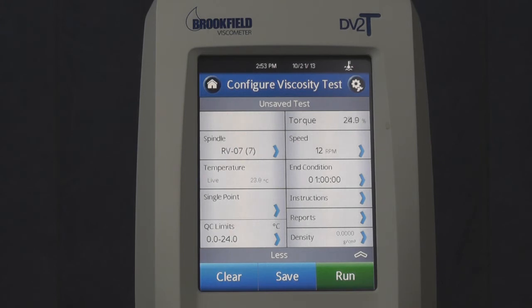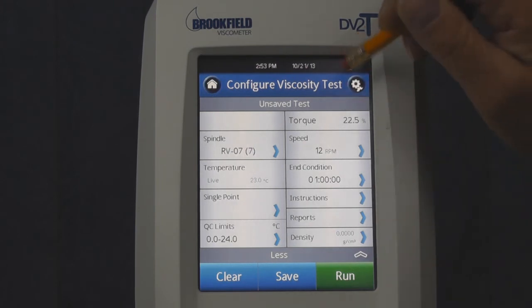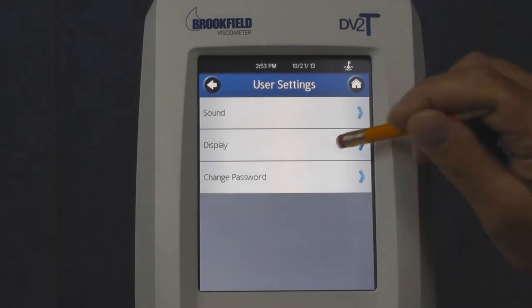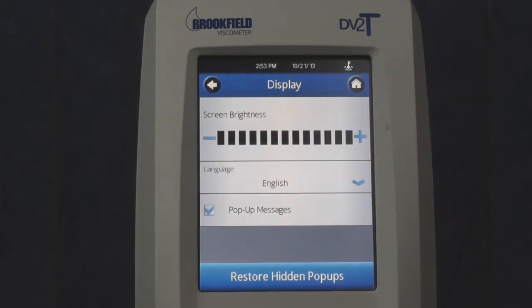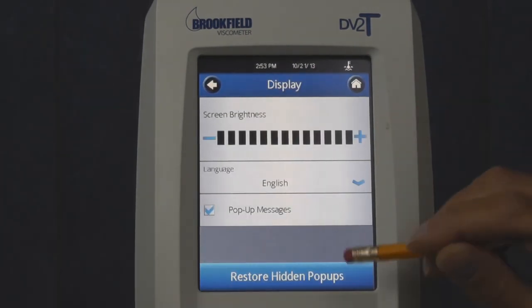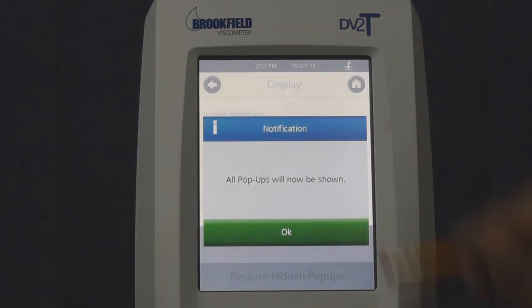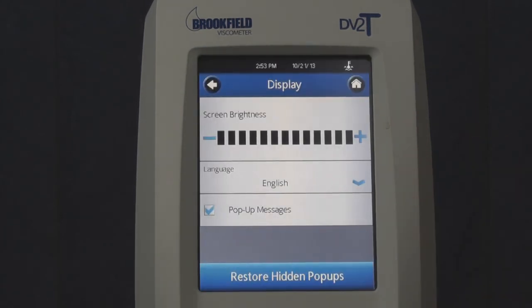In order to restore all pop-up messages, the user touches the settings icon button in the top right hand corner of the screen, then user settings, display, and then touch restore hidden pop-ups, and then touch OK. All pop-ups will now appear again.